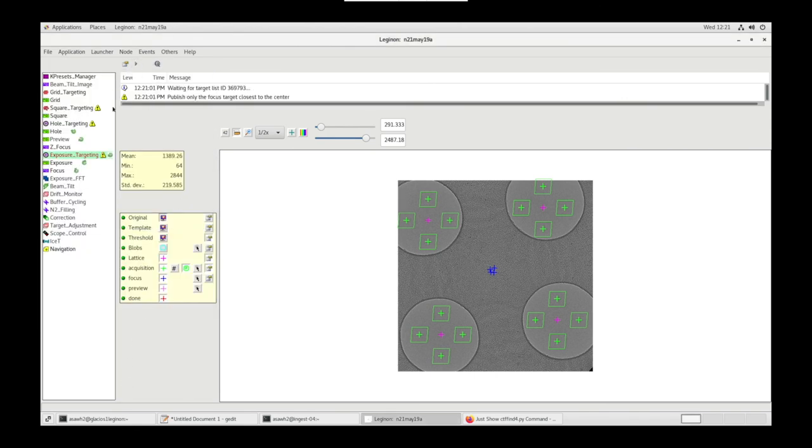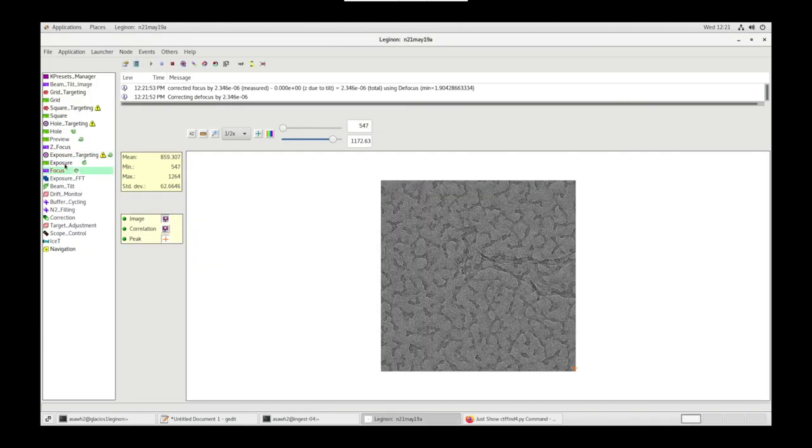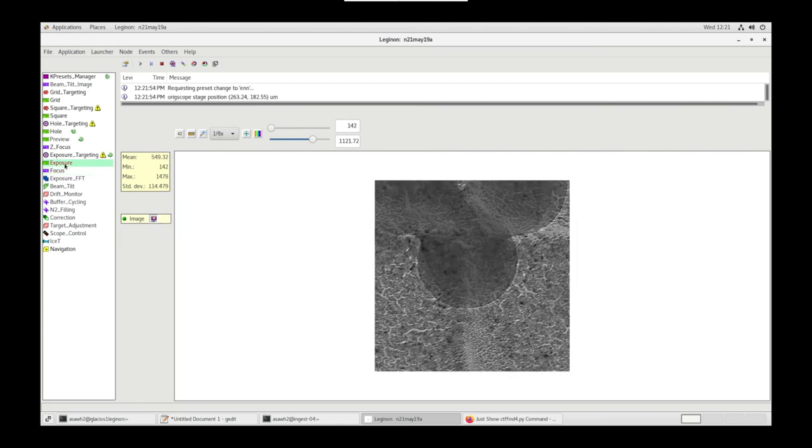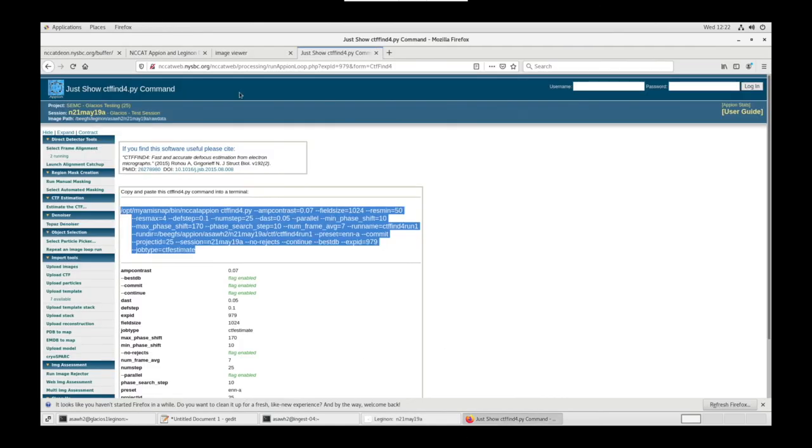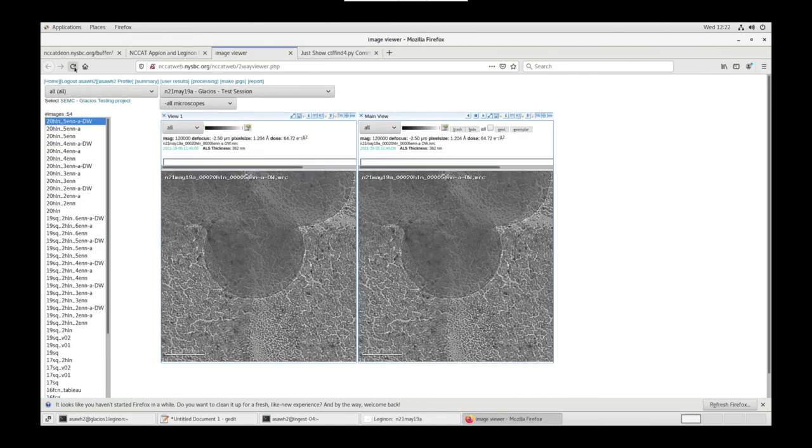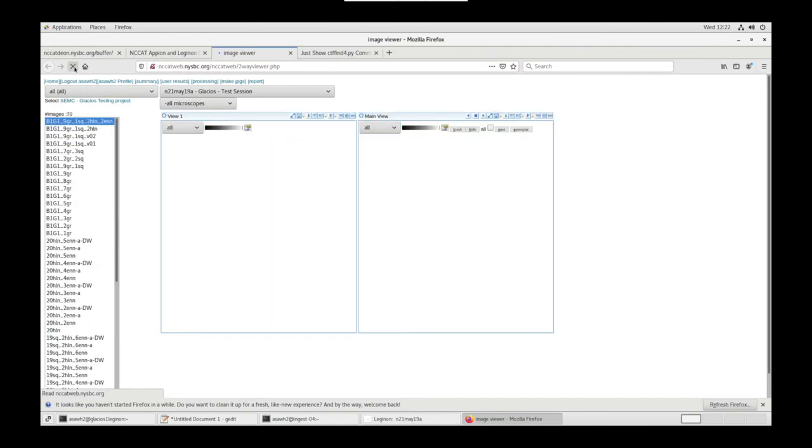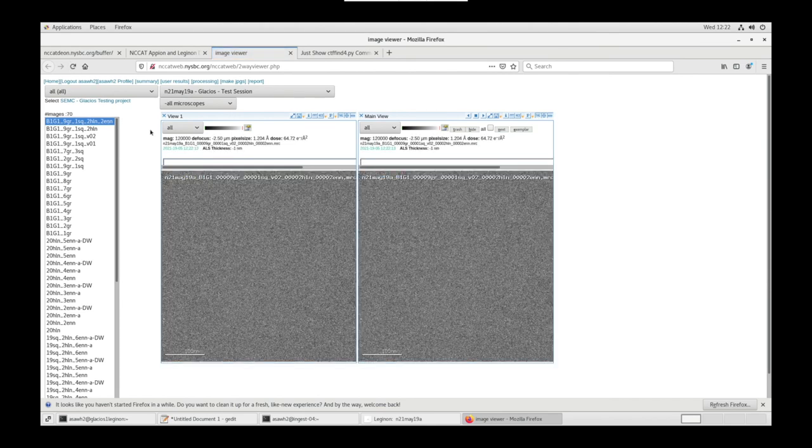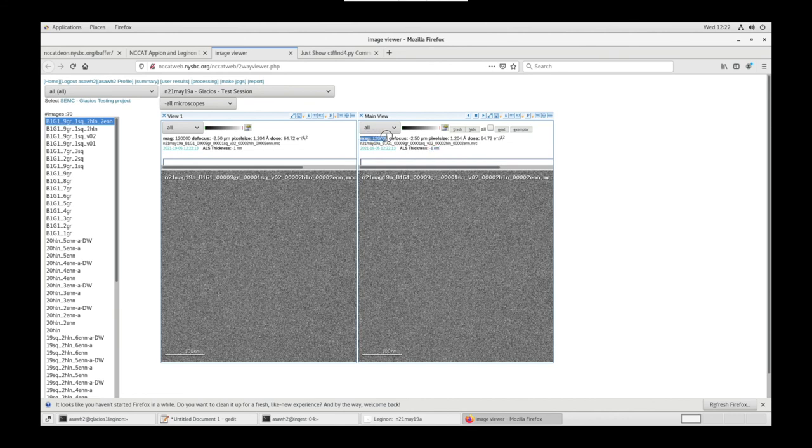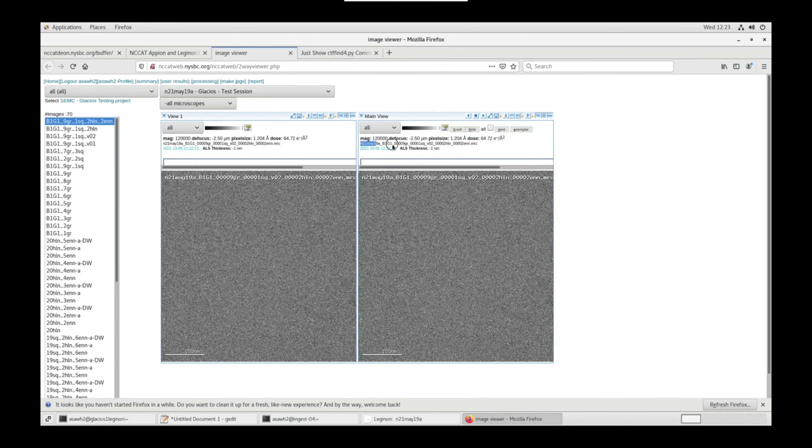After Focus is complete, you'll see all of your exposures coming in. Let's go back to NC-CAT Web, Image Viewer, Refresh, and you'll see all of your ENN images. You'll be able to see your ALS ice thickness, your magnification, your defocus, your pixel size, your dose for each image. And this is the name of your image.